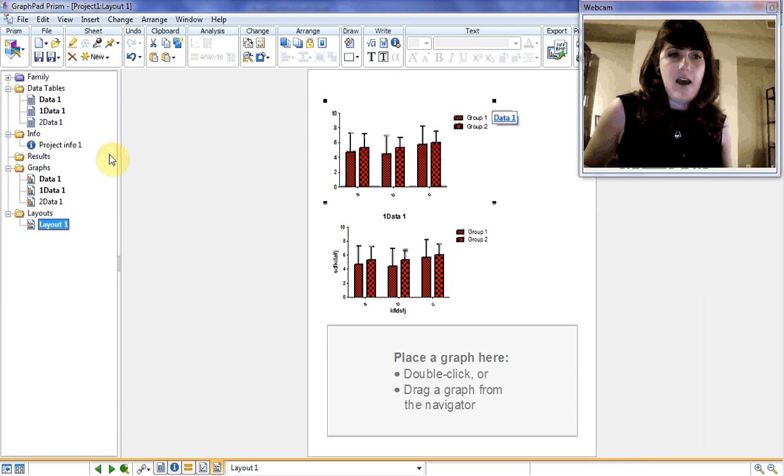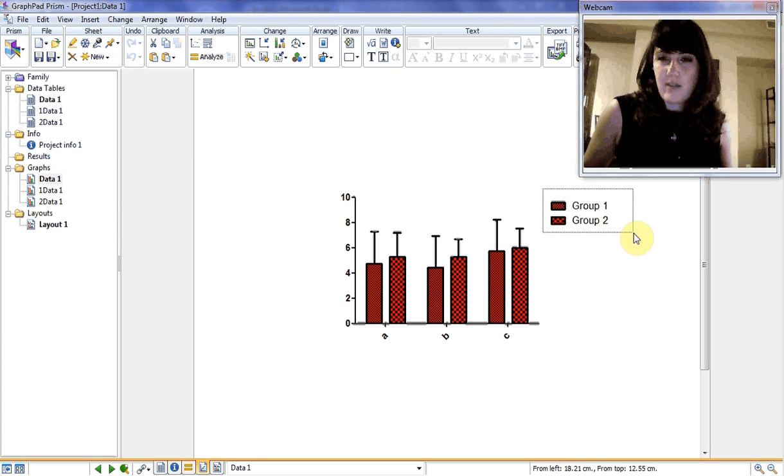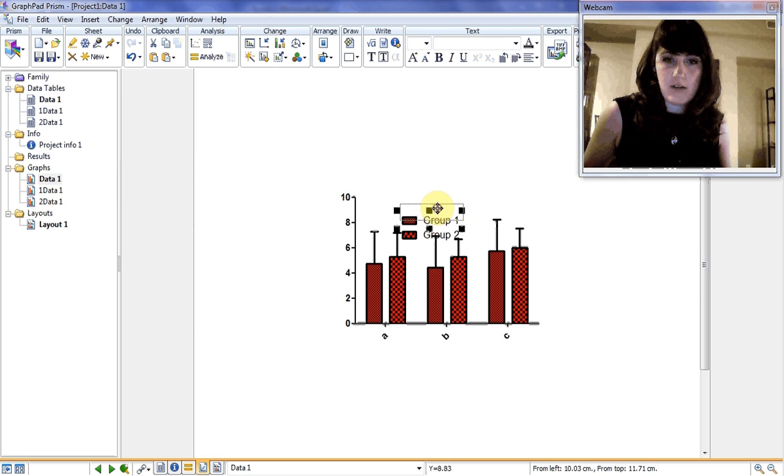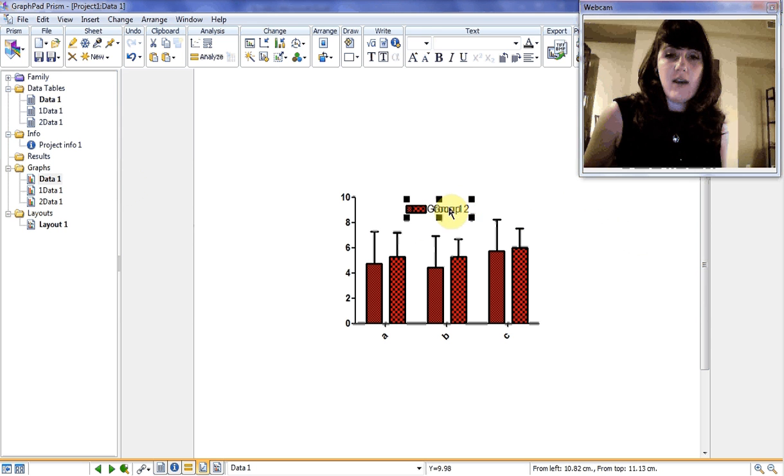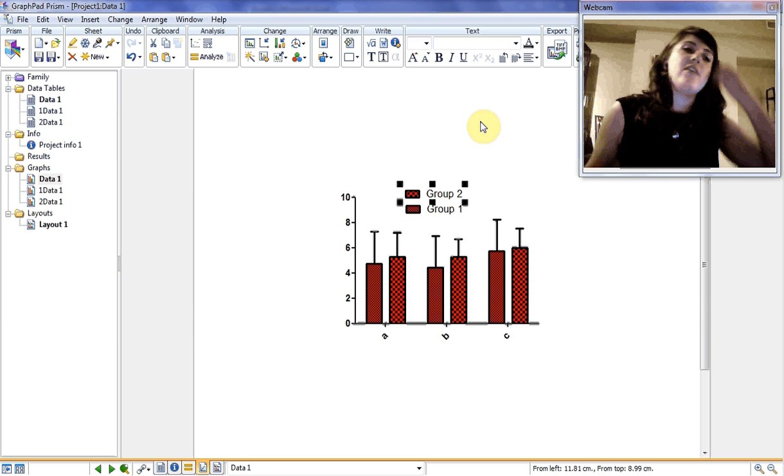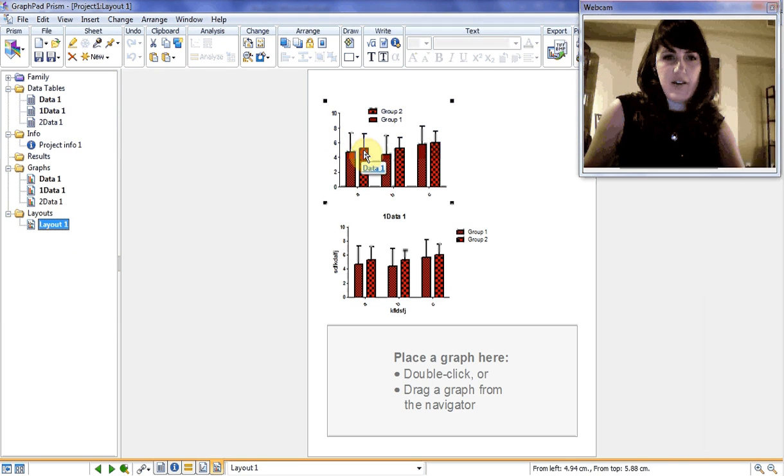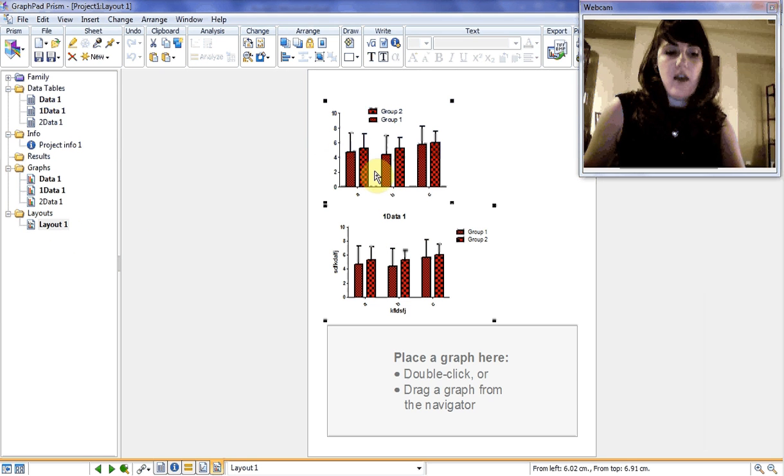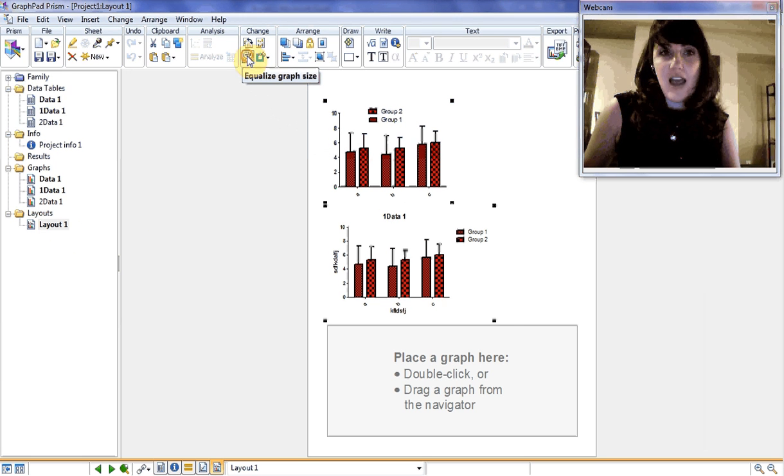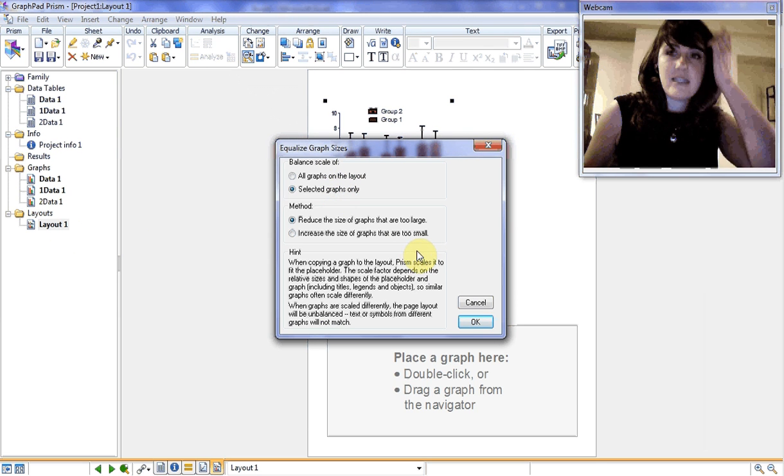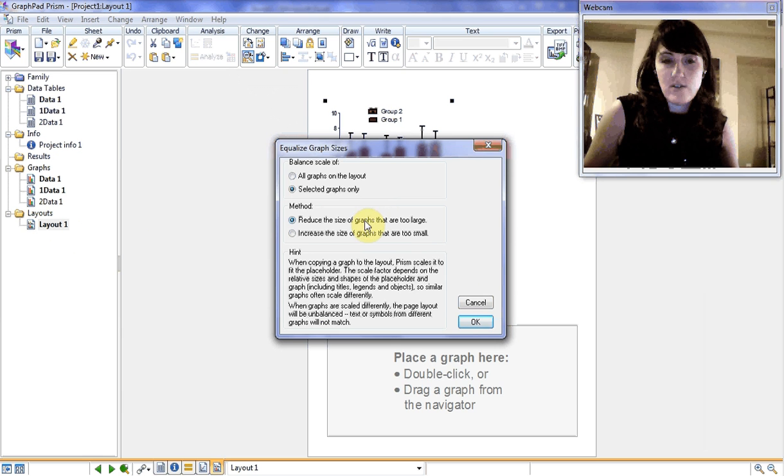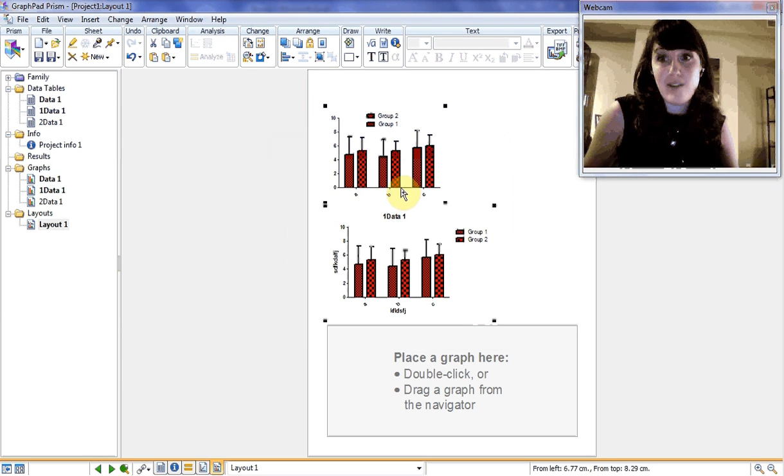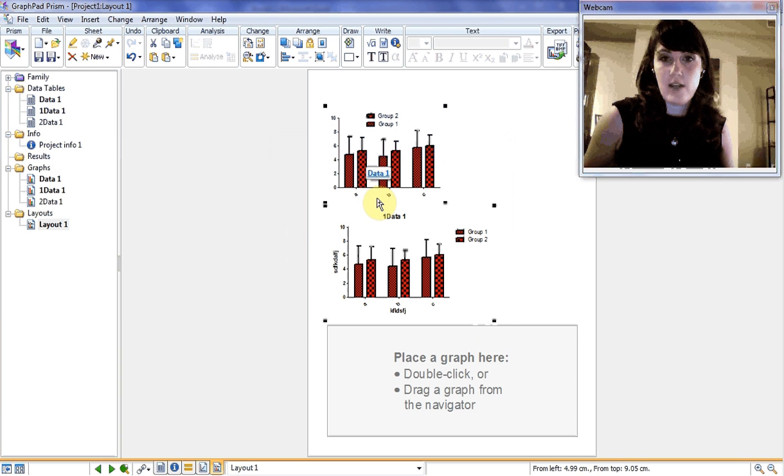Say I don't like them where they are. I'm going to highlight them and I can move them into the actual graph space. I can move them around. If I want group two first, they can go there. A really nifty thing that GraphPad will do: if you go back to your layout, if I Control and click on each of them, and I go to change, equalize graph size, it will automatically scale your graphs to the same size. You can choose to reduce the size of large graphs or increase the size of small graphs. That's very good if something's happened and you need to do that.